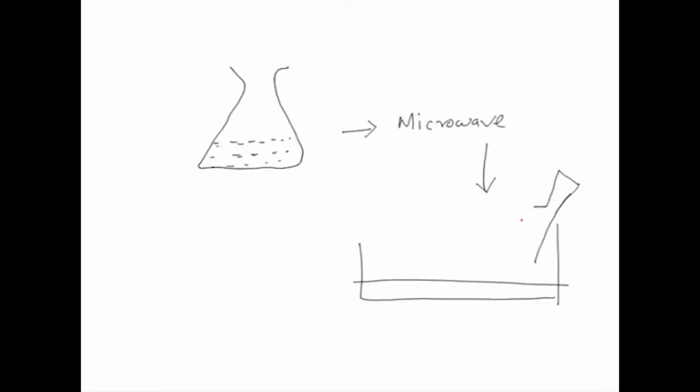Once you have poured it, if you see any bubble, you can push it away or remove it with a tip. Once that is done, there is a comb. What is a comb? A comb looks something like this. These are slots here. The comb goes into the gel, and these areas will be vacant, or wells will be created.